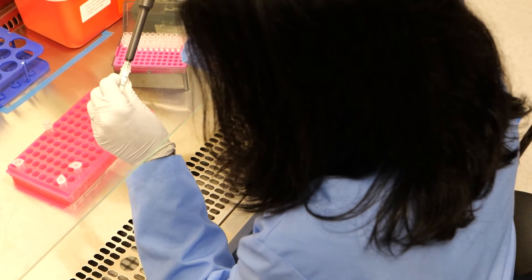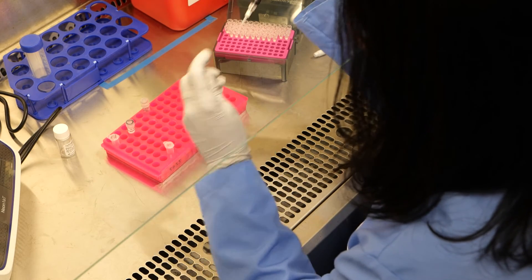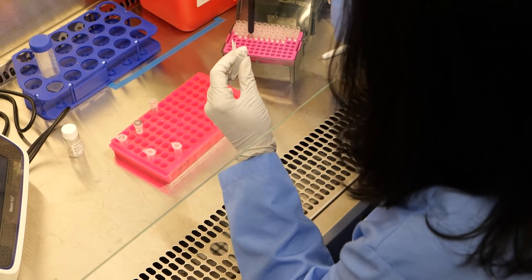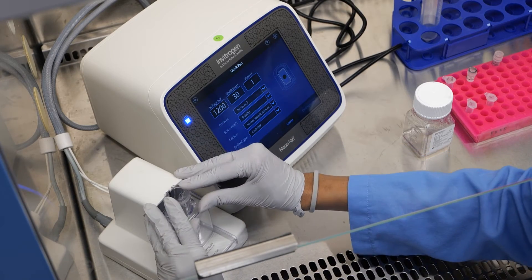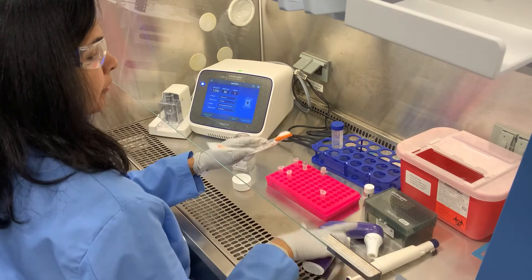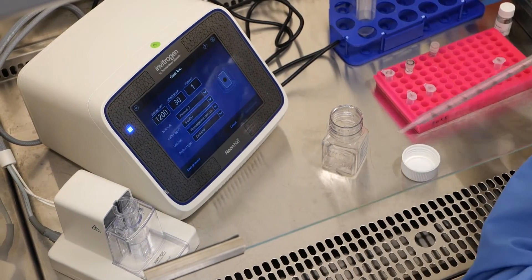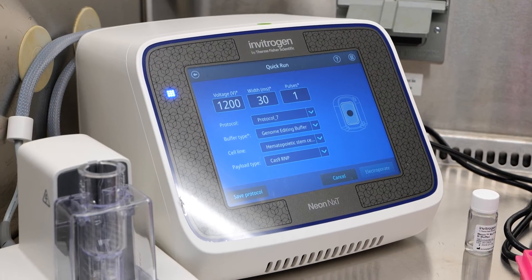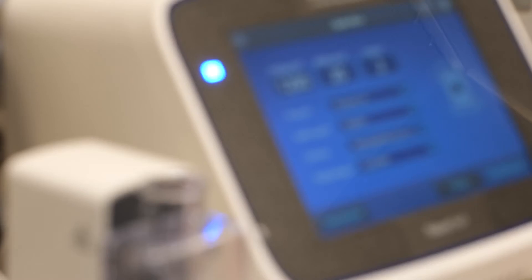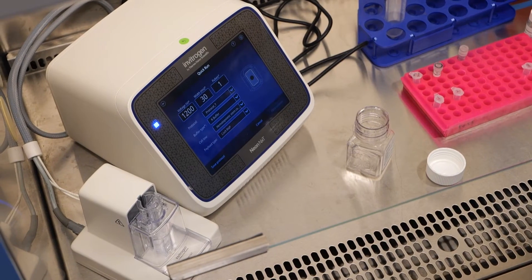We recommend 200,000 viable cells per reaction for iPSCs. Gently spin down 2 million cells, remove supernatant, and resuspend the pellet in 50 µL of resuspension buffer R. Mix 5 µL of cells with the 6 µL of each RNP complex. The increase in volume will help prevent bubble formation in the NeonNext pipette tip. The NeonNext electroporation system should now be set up. Add 2 millilitres of electrolytic buffer to the sterile NeonNext tube and insert it into the pipette station. Load your experiment from the Thermo Fisher Transfection Lab or use the Quick Run function. For iPSCs, we recommend either 1200 volts, 30 milliseconds and 1 pulse, or 1200 volts, 20 milliseconds and 2 pulses. Using the NeonNext pipette and 10 microliter NeonNext tips, gently mix your cell and RNP complex mixture.